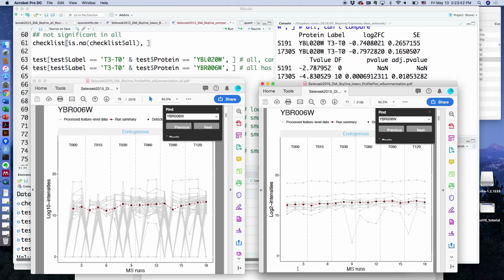Right, because for that we need a prior study, like another pilot study, so we can know which peptides are more noisy and which are not. But this rarely happens, right? This is not an easy kind of situation. I think that is a major point.